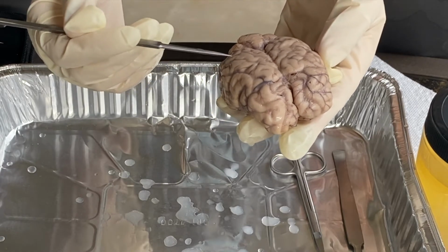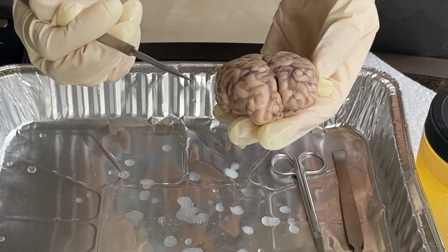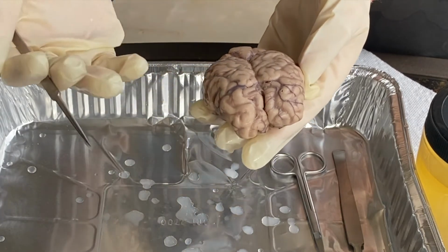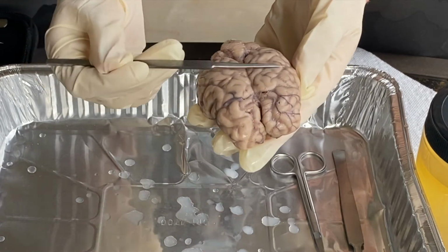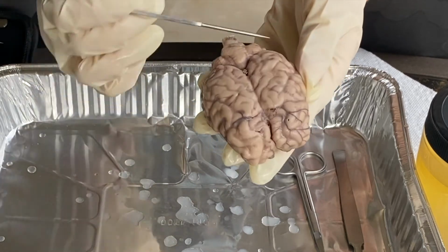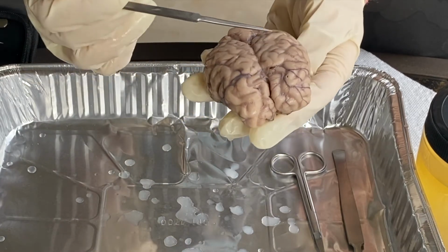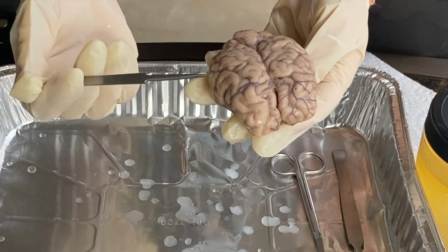Then we have our 4 cortexes. The cerebral cortex is basically the outermost layer of the brain, and it has 4 parts. So this part is your frontal lobe, and then you have your parietal lobe here, and then you have your occipital lobe back here, and your temporal lobes here and here. And there's 4 lobes on each hemisphere, so a total of 8.